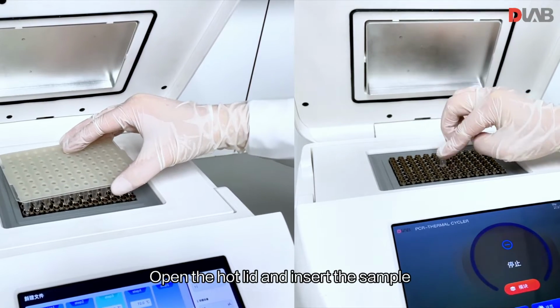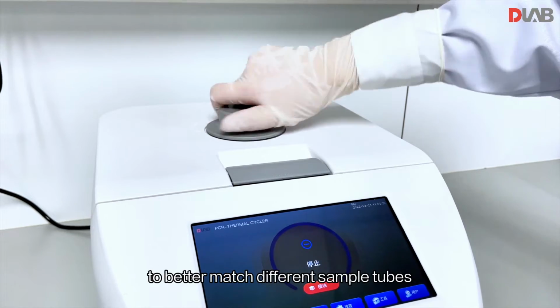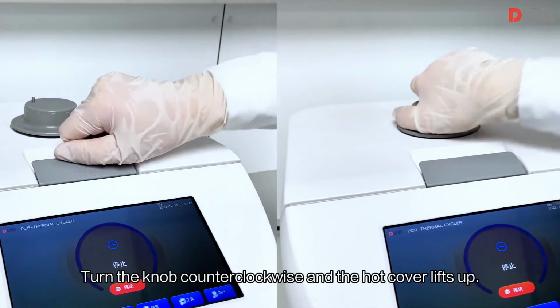Open the hot lid and insert the sample. Adjustment knob of the hot cover: different heights of the hot cover can be adjusted to better match different sample tubes. Turn clockwise and press the cover down until you hear a click. Turn the knob counterclockwise and the hot cover lifts up.